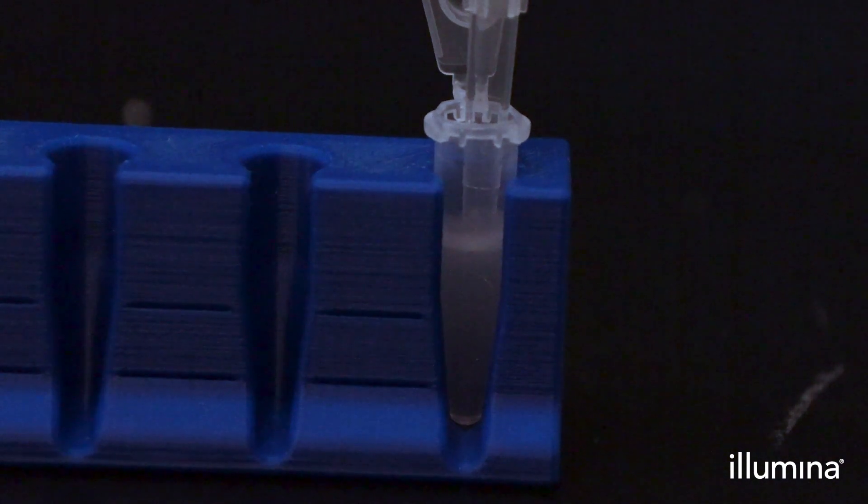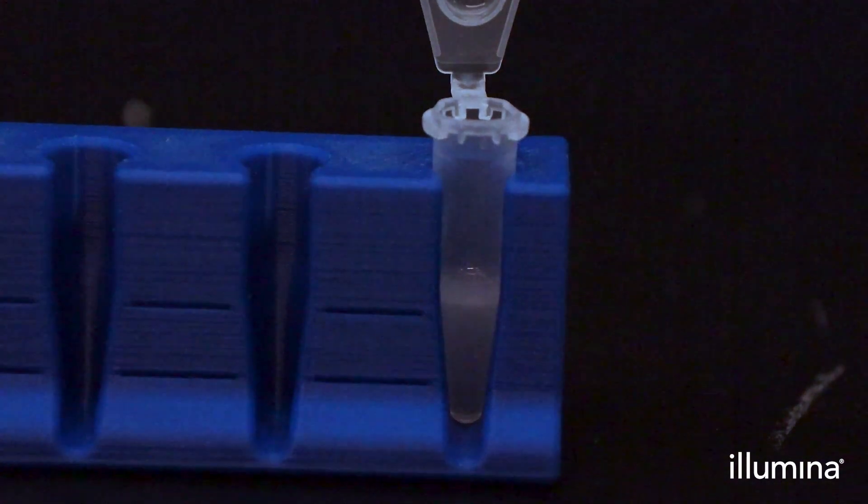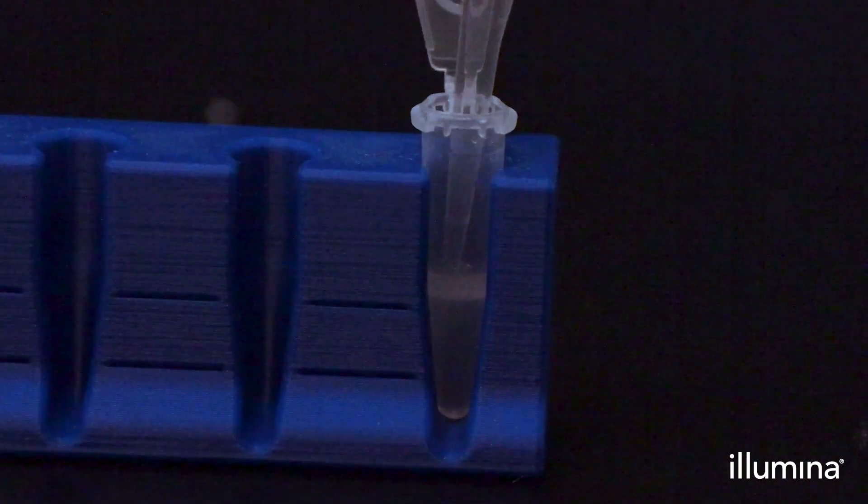After the emulsion has stabilized post-vortexing, use a low-retention P200 pipette tip to pipette out 115 microliters of partitioning reagent from the bottom phase. Place the pipette tip at the bottom of the tube and wait 5 seconds before aspirating. Wipe the tip on the side of the tube on the way out to avoid any sample loss due to pips retention to the pipette tip.